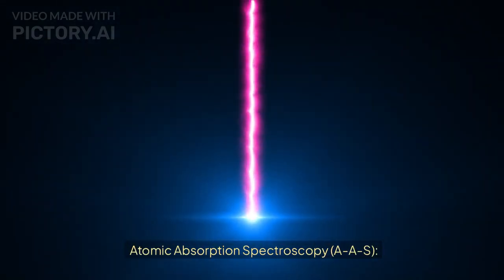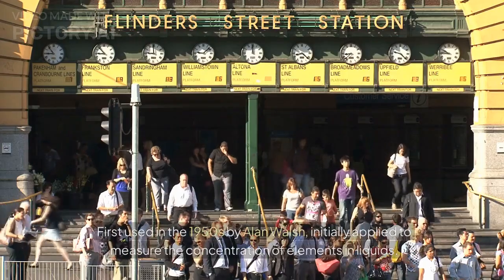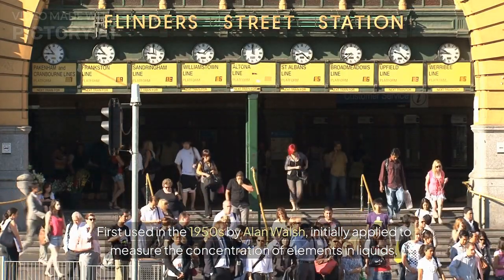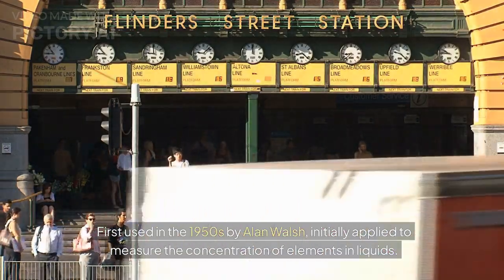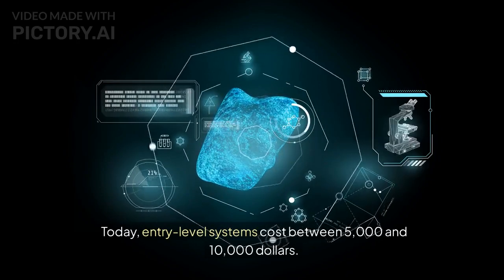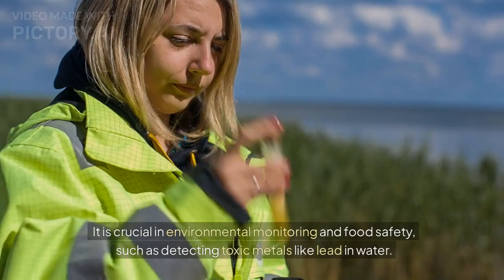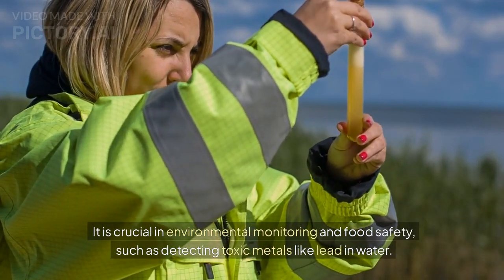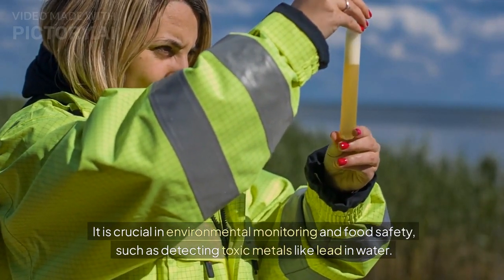Atomic Absorption Spectroscopy, AAS, first used in the 1950s by Alan Walsh, initially applied to measure the concentration of elements in liquids. Today, entry-level systems cost between $5,000 and $10,000. It is crucial in environmental monitoring and food safety, such as detecting toxic metals like lead in water.